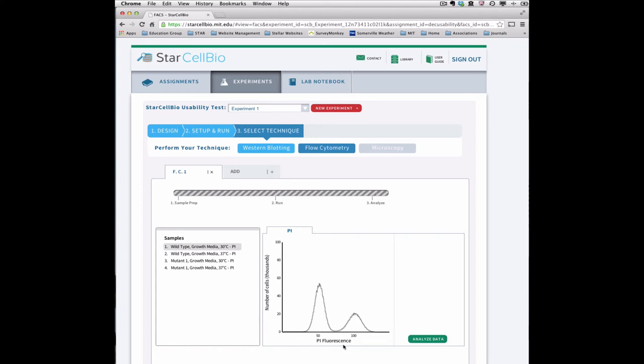To visualize the data for each sample, select the sample name in the Samples window.